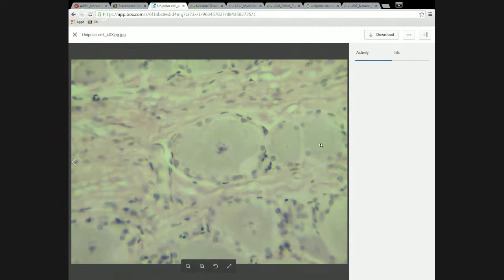There are smaller looking cells alongside of it. The fact that we don't see a nucleus in these cells probably means that we're not cutting through the center of those cells. Okay, so we might be sort of slicing off the edge of the cell or something like that.